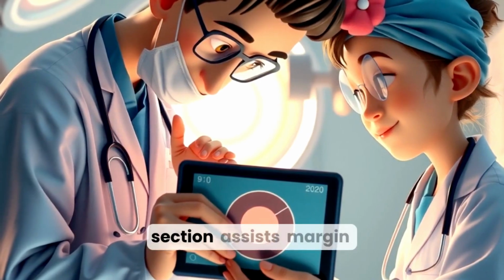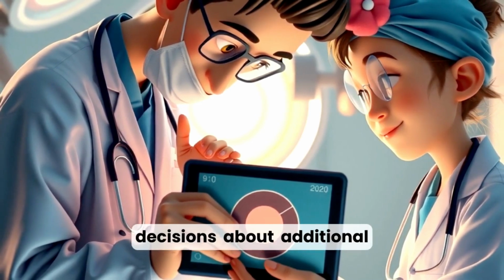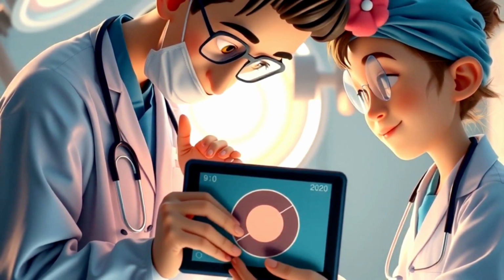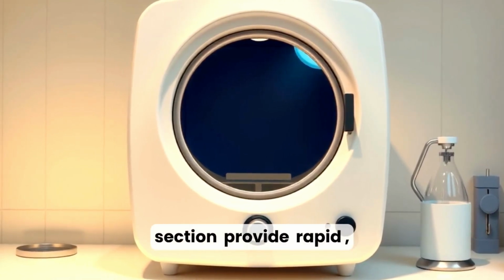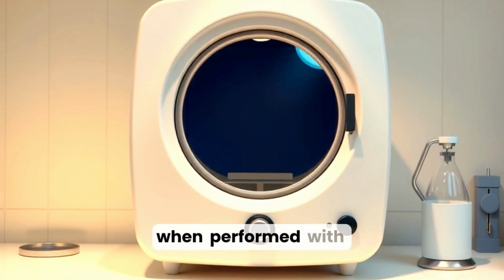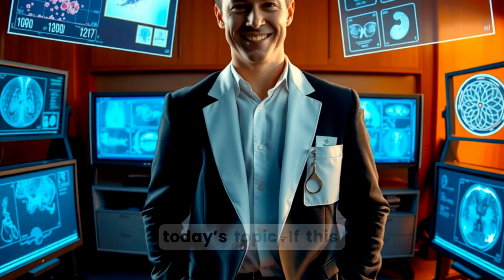Clinically, frozen section assists margin assessment, tumor type confirmation, and decisions about additional resections or procedures. In summary, the cryostat and frozen section provide rapid, actionable information when performed with proper technique and attention to artifacts. And that wraps up today's topic.